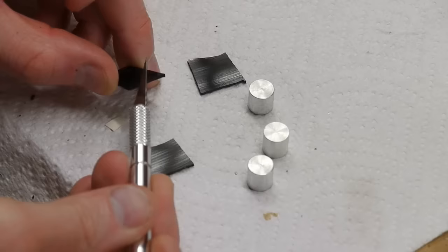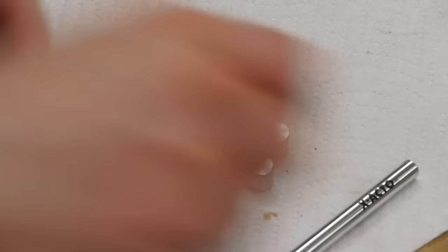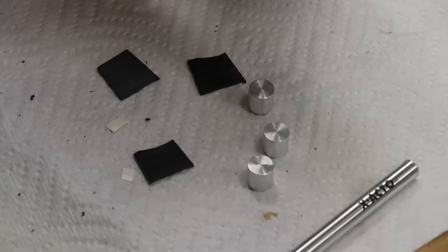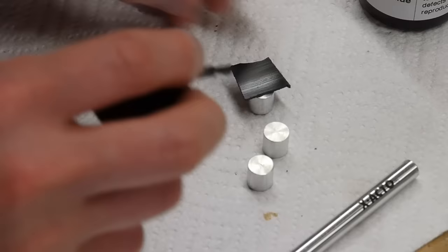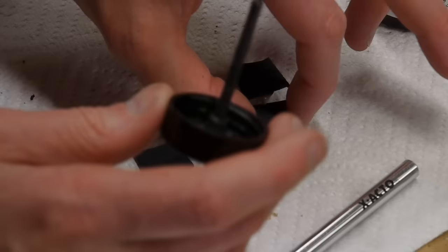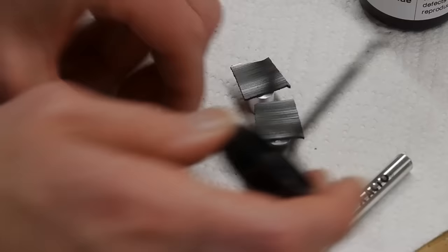The next problem is that the electron microscope cannot image things that are electrical insulators. The microscope works by firing electrons at the object that you want to inspect, and if the object is an insulator those electrons get trapped inside. Eventually if enough electrons get trapped there, future electrons coming in will be repelled because like charges repel each other.